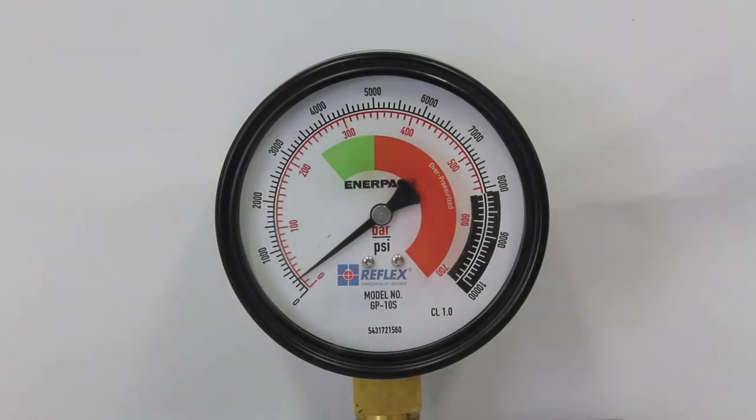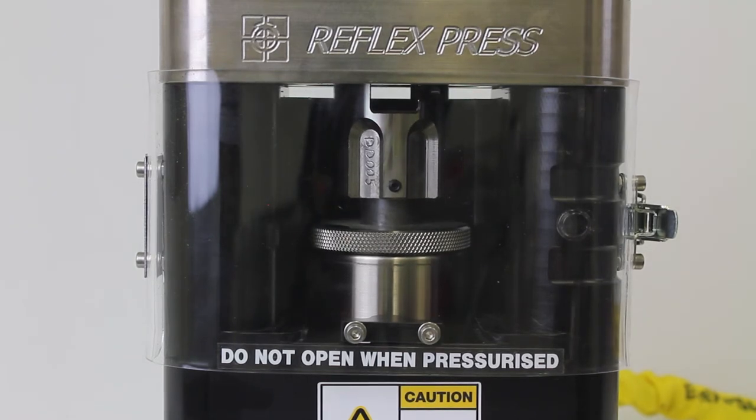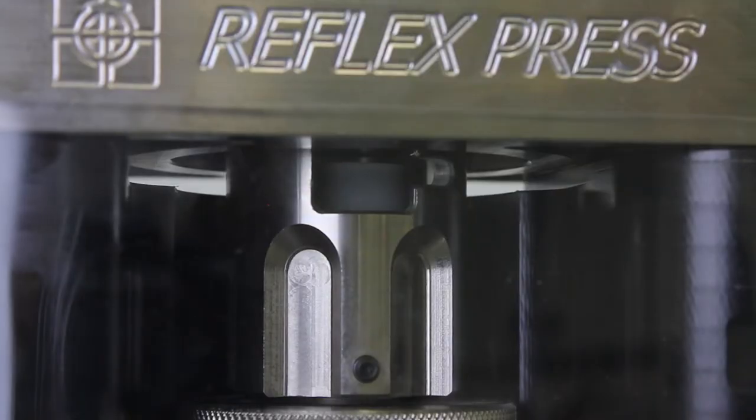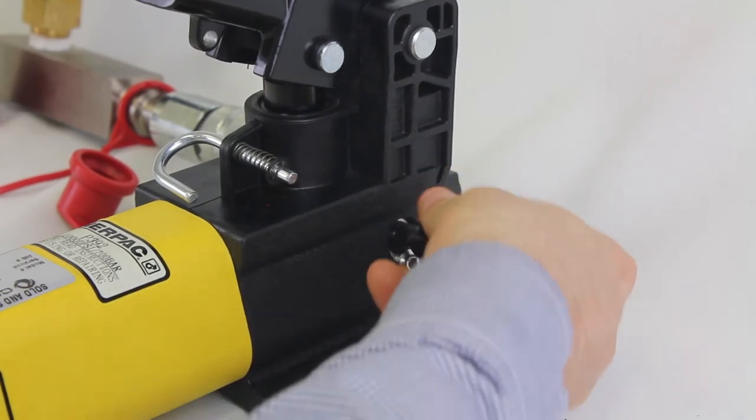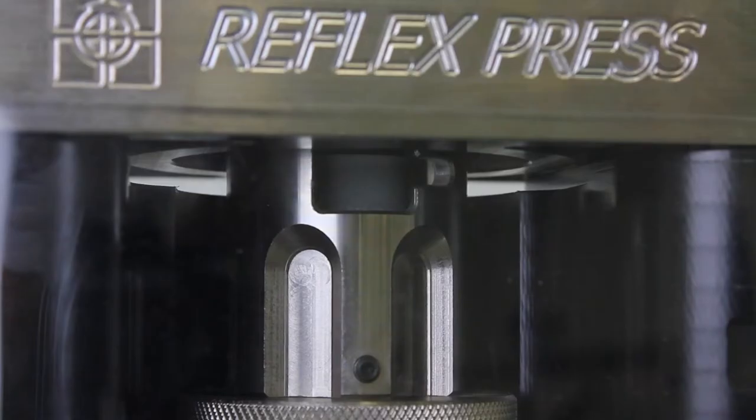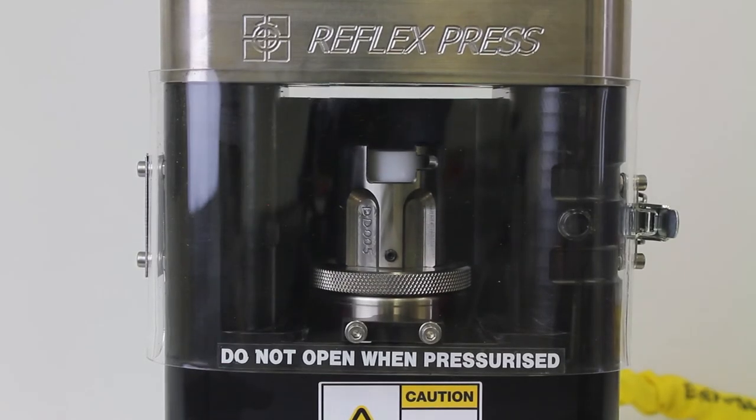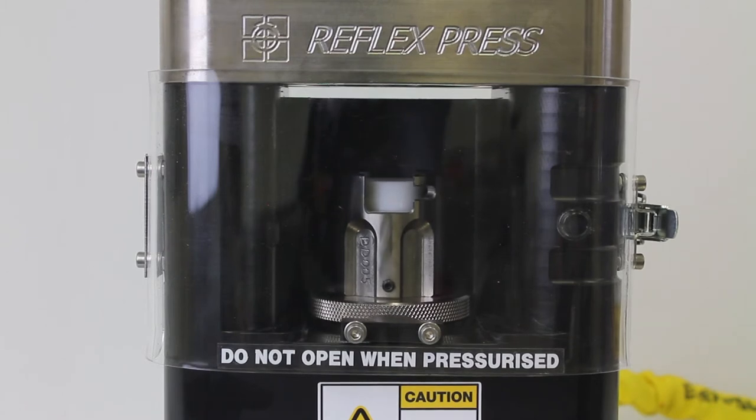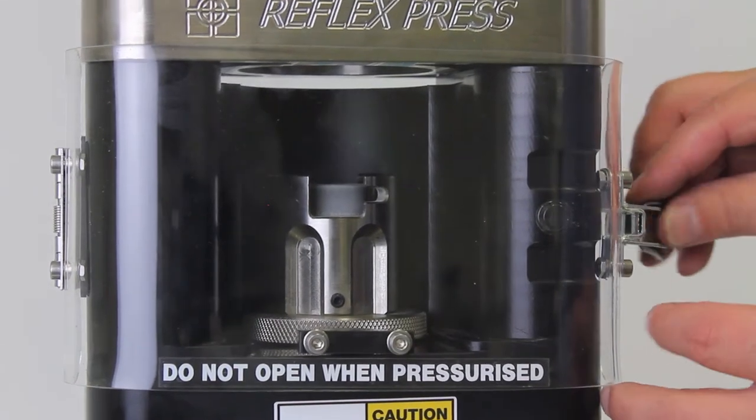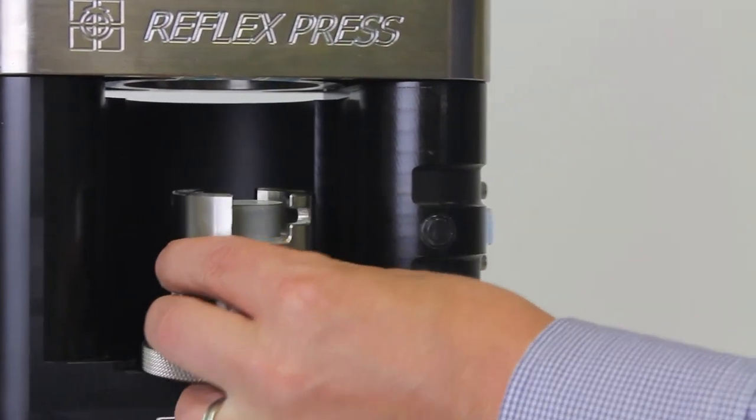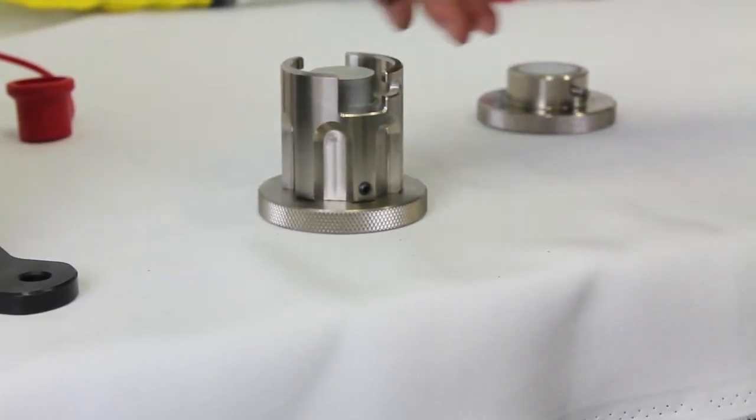During this process, observe the pressure gauge. The pressure should not exceed a few hundred psi. If it does, check everything is in order before continuing. Once the sample is completely free of the die, open the pressure relief valve. Once the cylinder is fully retracted, remove the die. Remove the sample, clean, and repeat.